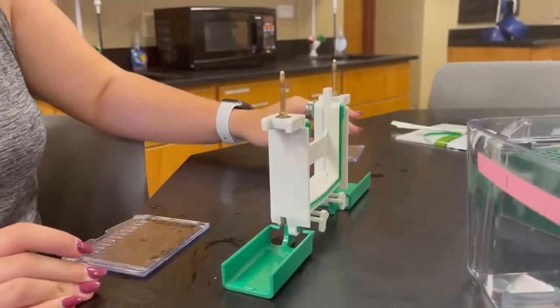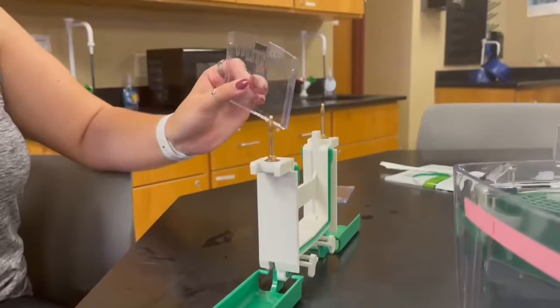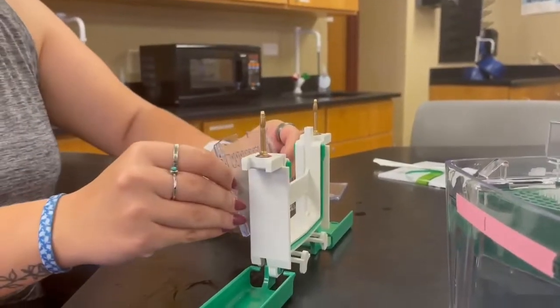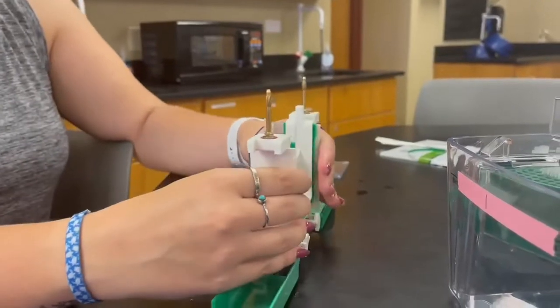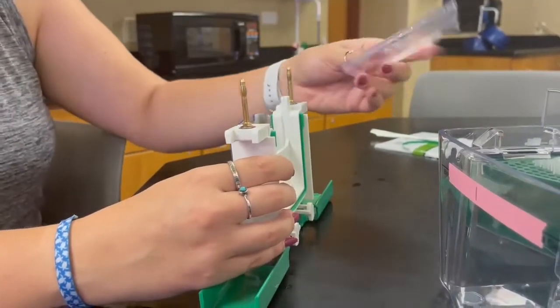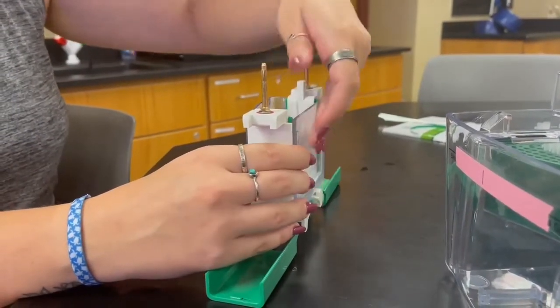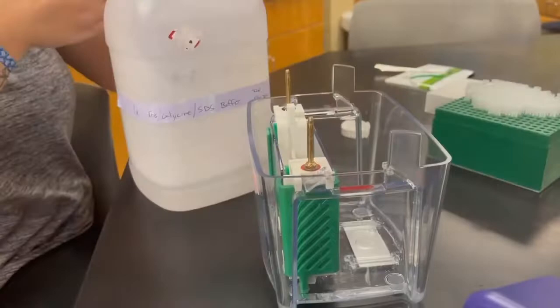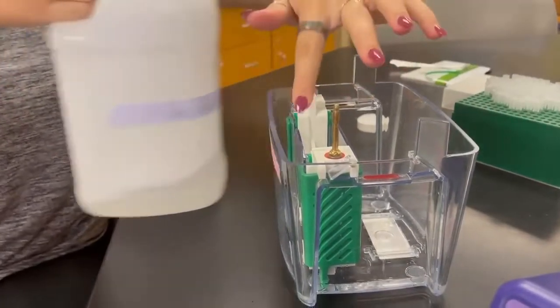So this is how we're going to run our SDS page test. This is the gel we are using to run our venoms and our saliva. We're going to put it on the one side, and then, since we're only running one gel, we're going to use a plastic from another gel that we ran to prevent leakage when we pour our buffer. So the next thing we're going to do is pour the buffer into these chambers.